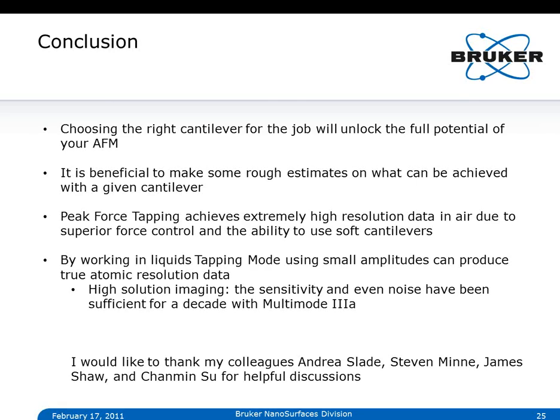However, if you have strong adhesion, you just need one patch of strong adhesion, and then it's game over, and your cantilever gets sucked into the surface. Whereas in peak force tapping, we separate these issues and use the Z piezo to move the cantilever without affecting feedback. These are the two things I think you have to separate and look at in their own context.